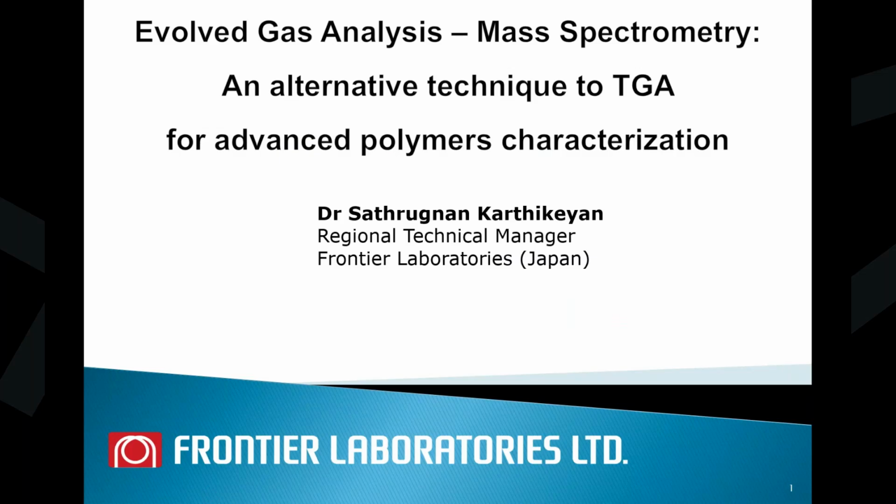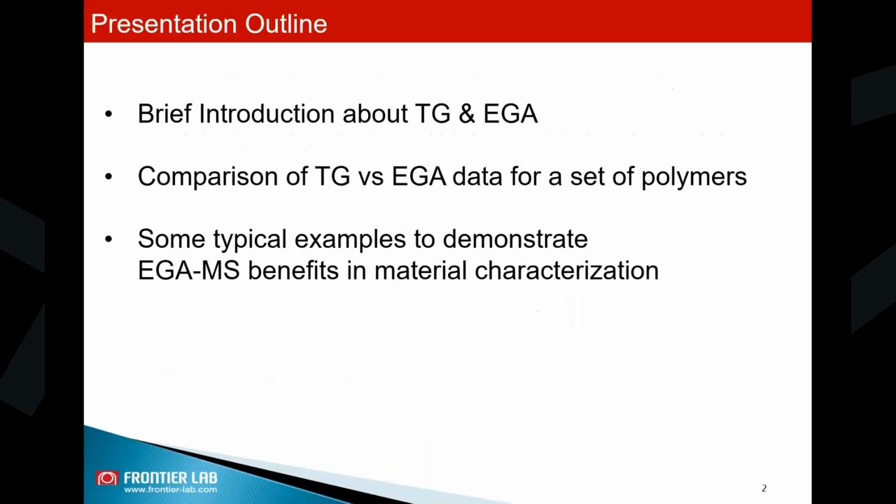Okay, so myself, Sathrugnan, working as a regional technical manager for Frontier Laboratories, and I'm located in Singapore. In the next 30 minutes, I'll be giving a brief introduction about TGA and EGA, then show some data in terms of comparison for different sets of polymers. Then finally, I will share some typical examples of how the evolved gas analysis can provide some additional information compared to the TGA data.